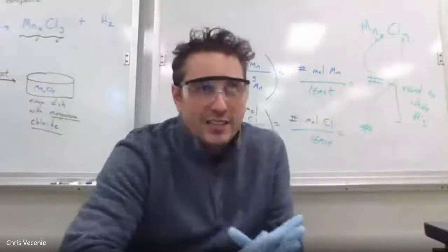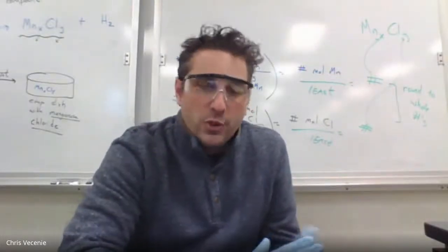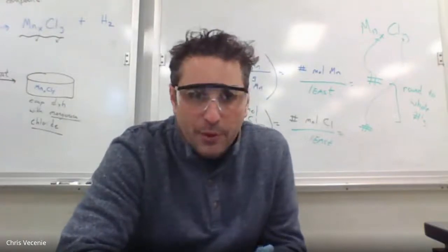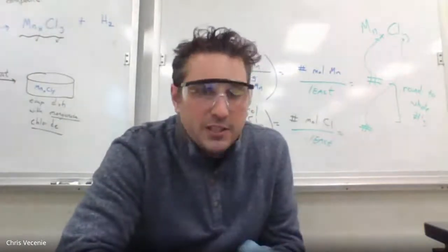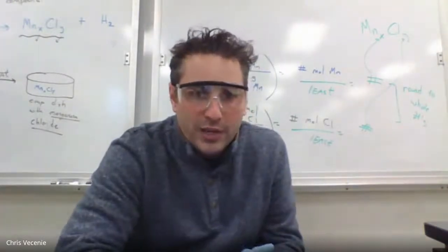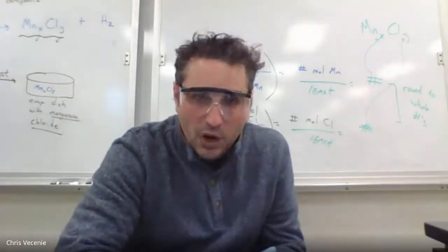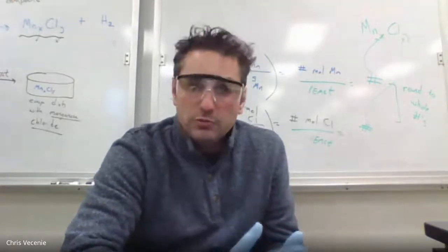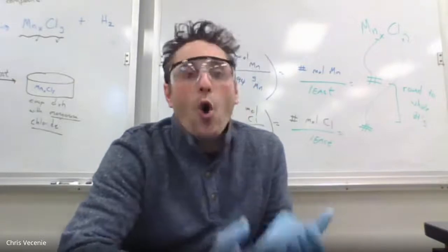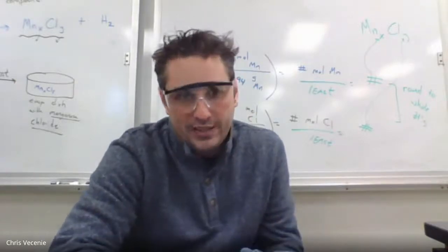There's no need for you guys to sit here and watch that occur. It's still going to take a little bit of time for that to evaporate. But again, you guys can be productive working with your lab partners, work on those PostLabs, work on those few star calcs you can get. What's sent to you as a whole class is going to be a picture with the final product sitting on the balance with the number you need to fill in your last number for your data table.